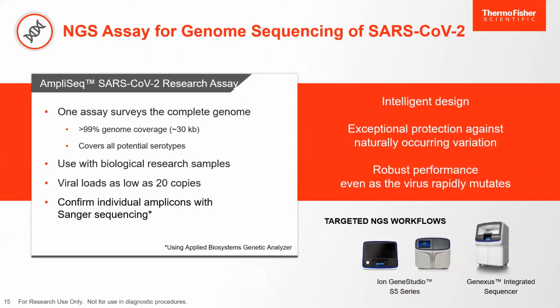When looking at whole genome sequencing as a whole, what you're looking for are the opportunities for the discovery and characterization of generally new viral, bacterial, and fungal organisms. But when you're looking at specific microbial or genetic structures, looking at the entire genome is an important step. And it's often the basis of any research project in molecular biology to go further.